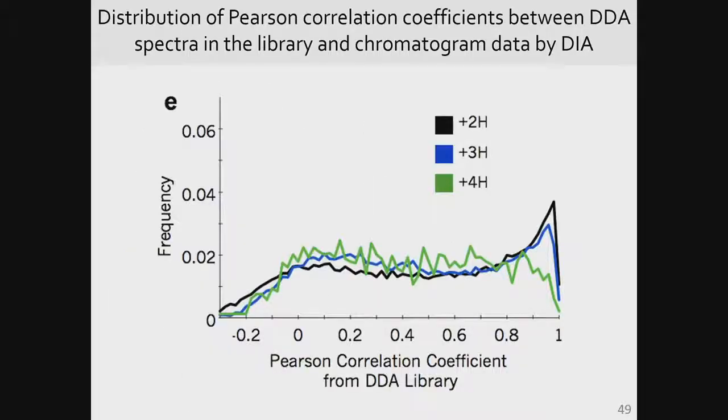The reason why we wanted to look at the fragmentation method is that with HCD, when you do data-dependent acquisition, the instrument automatically triggers a given collision energy dependent on the charge state determined from the MS1 signal. So you may actually have the optimal collision energy for a given peptide of a +3 or +4 or +5 precursor that's stored in your library. But when you do data independent acquisition, because you may have 10, 15, 20 different things within your isolation window, we just apply a single collision energy. In our case, we apply it optimally for doubly charged.